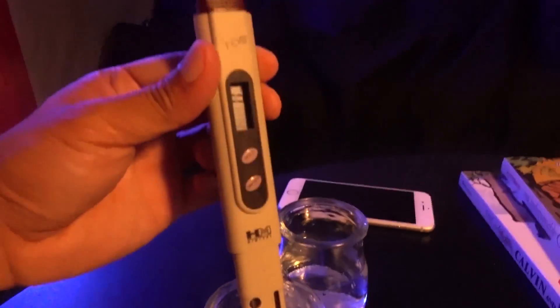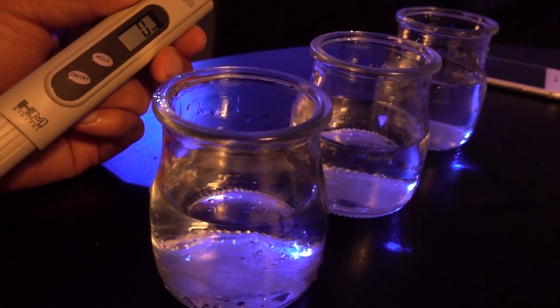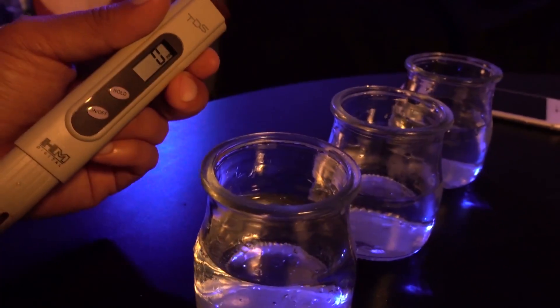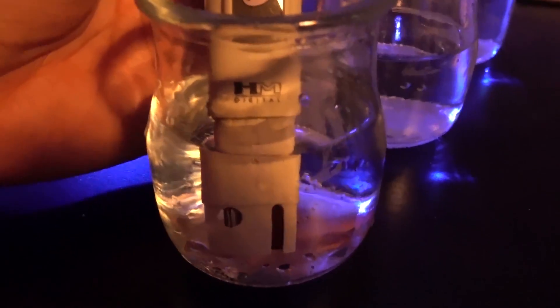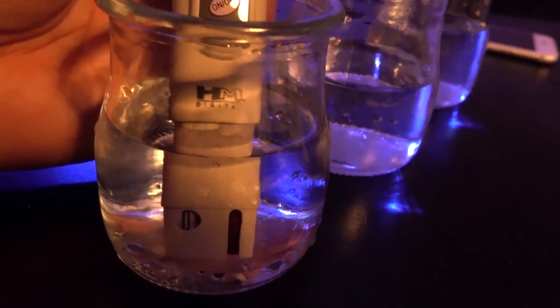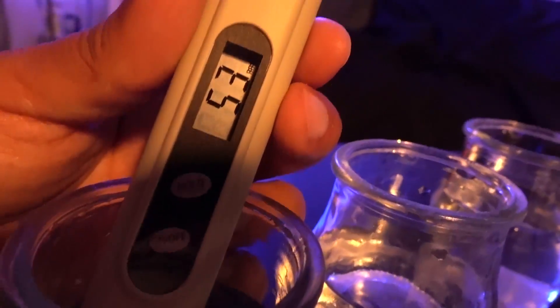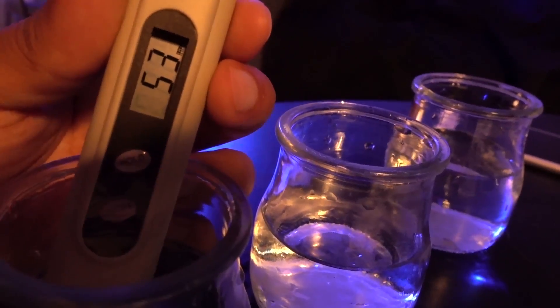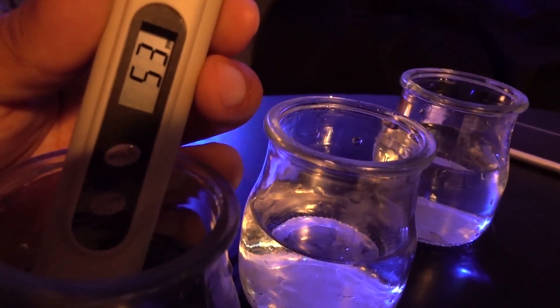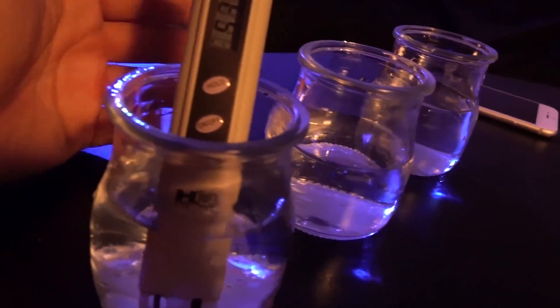Now the one I'm really curious about is the reverse osmosis water from Walmart in Germantown, Maryland. They have a schedule of people maintaining the unit so I have high hopes. Why don't you guys take a guess and write your answer in the comments below — how much faith do you have in Walmart providing good water? Alright, here are the results: 54 to 53. It's not as low as I had hoped, but compared to my tap water it's about 75% better.